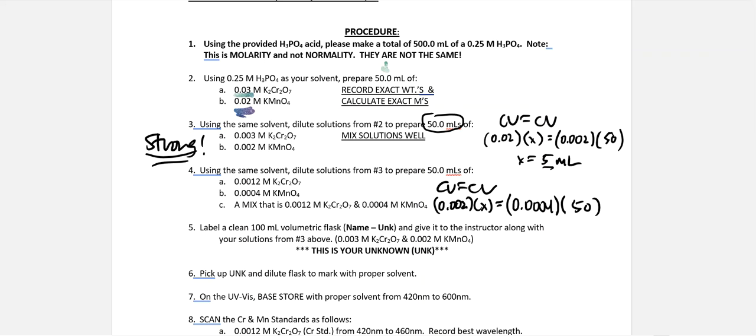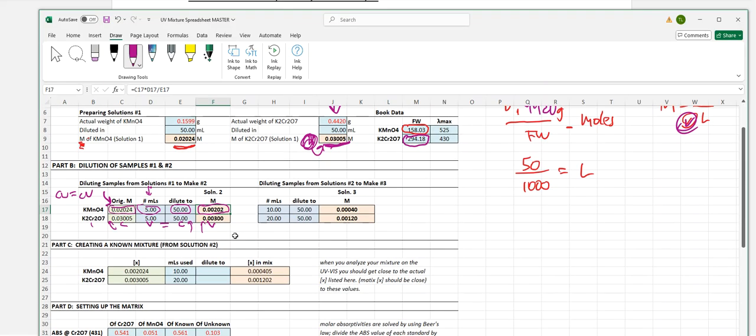All right, so the issue here is that you just need to keep track of your concentrations, and it looks like based on these calculations, a 20 to 50 would work, and a 10 to 50 would work.